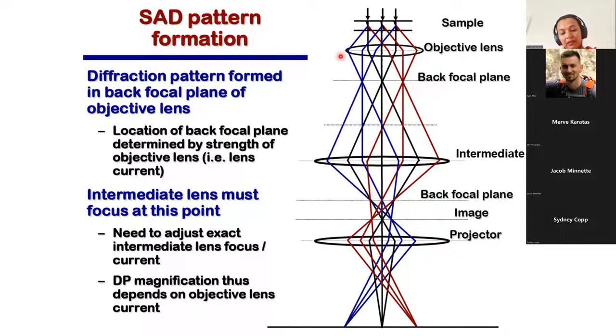So in practice, we should be doing this activity. I would take some iron chromium samples and ask you to measure the distance between the points. And you would see that the difference between the points would change as you change the magnification. And thus having the right value of calibration here is of utmost importance.